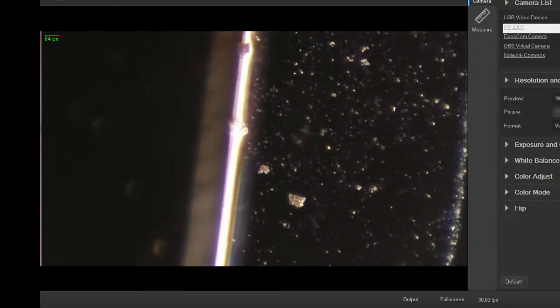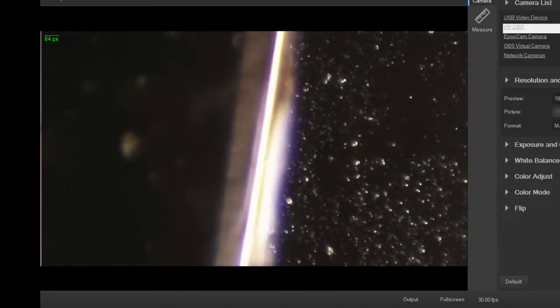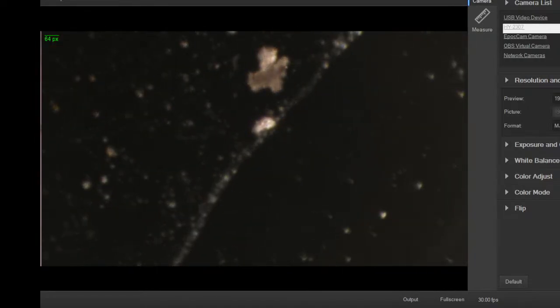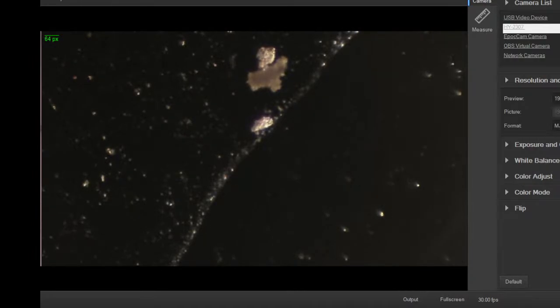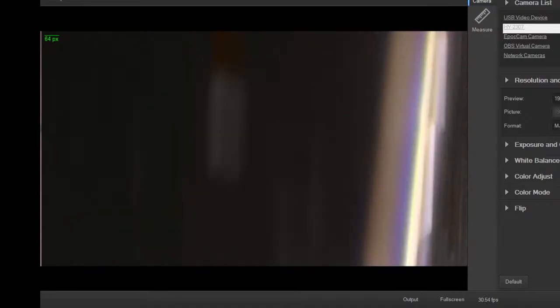The debris field on the edge of the cell, on the edge of the slide, just past the cover slip. I put just slightly more than a drop of water in here, so surface tension can't, it's too much volume to get it to stay inside the cover slip. So you can see the drying edge there, it's kind of a curved line of the actual edge of the water.